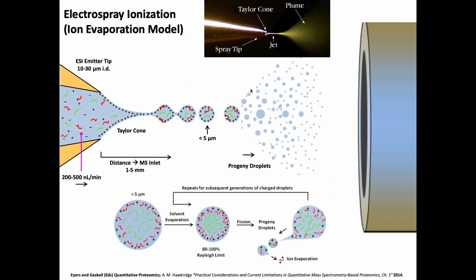Now, the colors of the red and the green are meant to show the effect of hydrophobicity. Okay? This is really important when you start talking about carbohydrates, because with carbohydrates, you're talking about something that is very, very hydrophilic. Okay? Heparan sulfate is the most hydrophilic biomolecule known. It's got the most charges. It's incredibly soluble.